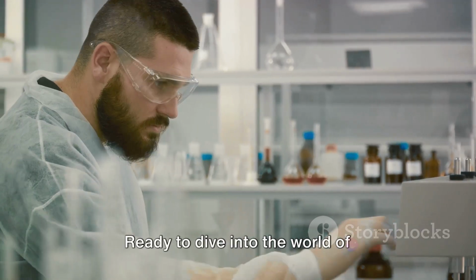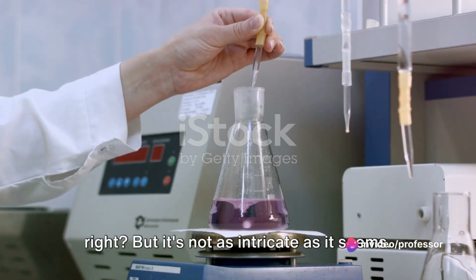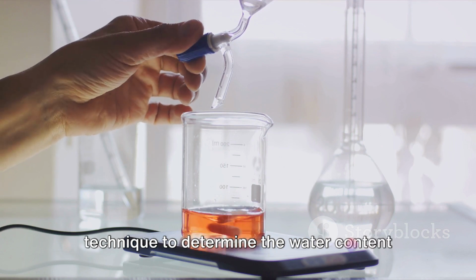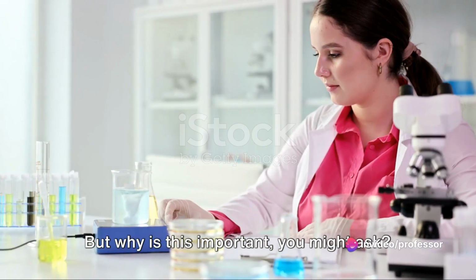Ready to dive into the world of chemistry? Let's begin with Karl Fischer Titration. Karl Fischer Titration sounds complex, right? But it's not as intricate as it seems. This method, named after the German chemist Karl Fischer, is an ingenious technique to determine the water content in a substance. That's right, it's all about water detection, but why is this important?